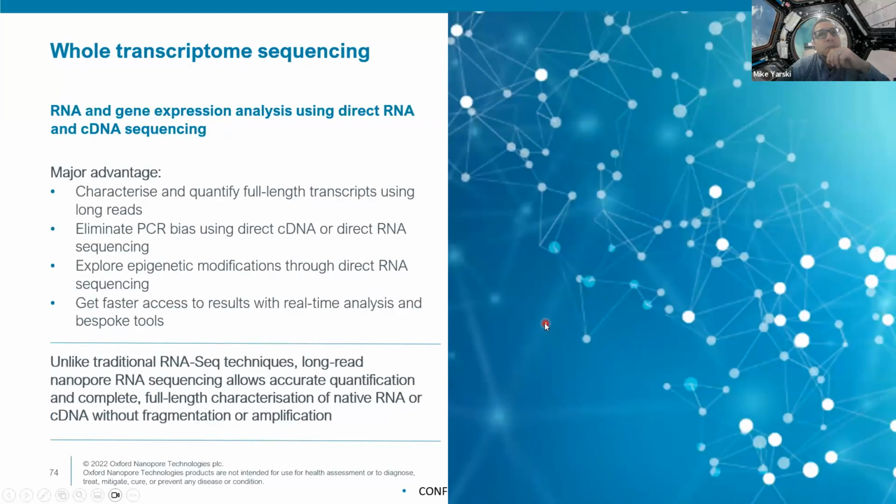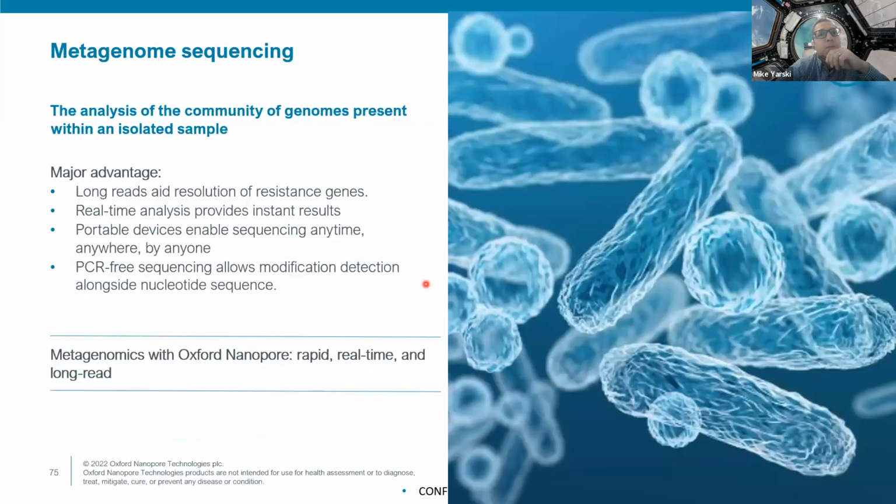And then transcriptomes, I just want to summarize that I think this is the best in class these days because every read is the isoform, as Warren pointed out earlier in his talk. And then metagenomics, of course, just gives you the full assembly of many of the pathogens or the bacteria that are in your sample. So to me, it's the best platform for doing metagenomics as well.